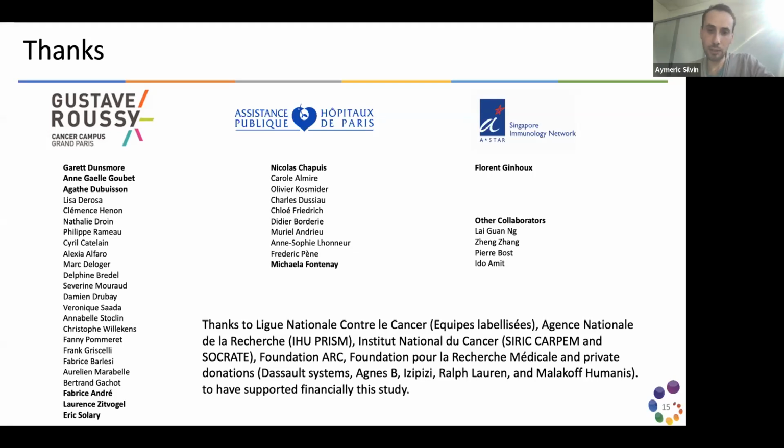And after, depending on your marker, try not to use colors that are close to each other for markers that are co-expressed, to make sure that you do not have an issue with compensation. And you can check your compensation, but if some of you use DAPI on a regular cytometer, for example, DAPI and Pacific Blue is a nightmare to compensate.